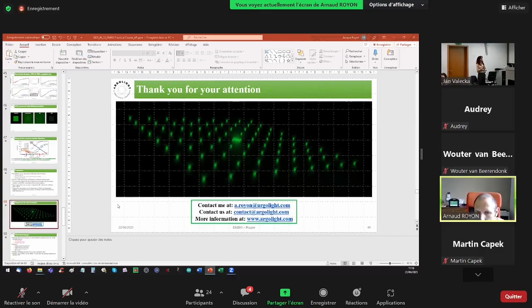The gradually spaced line patterns are engraved inside a glass that has the same refractive index as the microscope coverslip, and they are 170 microns below the glass surface. So they can be used to evaluate the performance of the microscope in the conditions they are designed for.